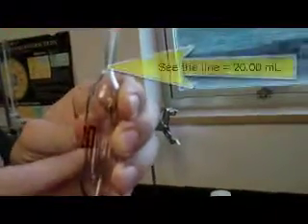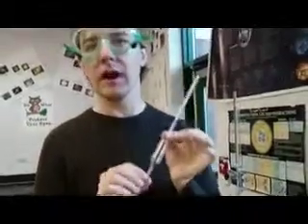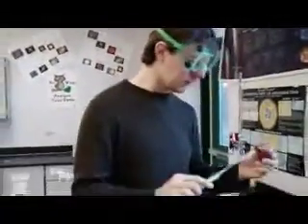And you'll notice this has a 20. What that means is that 20.00 milliliters will be dispensed if you start from the line and dispense all of it. An extremely accurate way to dispense, but it's kind of a pain because you have to pipette, and some people are not real great pipetters. Probably the best way, might not be the most convenient way.